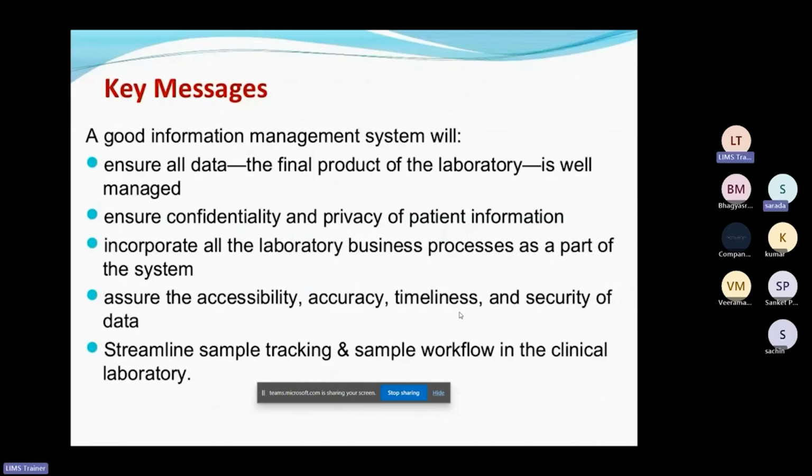So, what we have to consider in this implementation stage: we have to ensure all the data, the final product of the laboratory, is well managed. This is the motive why we are developing LIMS for a particular laboratory: we have to ensure there is not a single data leakage or single entry missed while performing the LIMS activities.